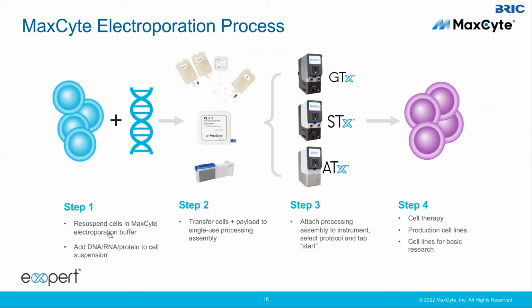You would resuspend your cells in MaxCyte buffer, add your loading agent, whether that's DNA, RNA, or protein, and transfer it to the processing assembly, attach it to the instrument, and electroporate. Electroporation is pretty fast. And then afterwards, you would carry it on for downstream applications.